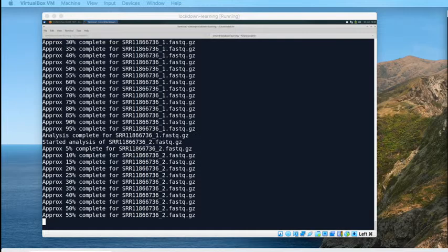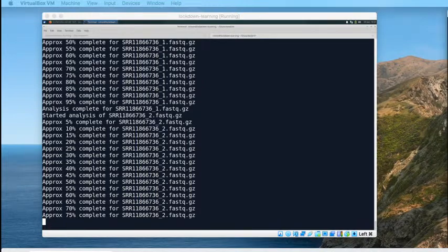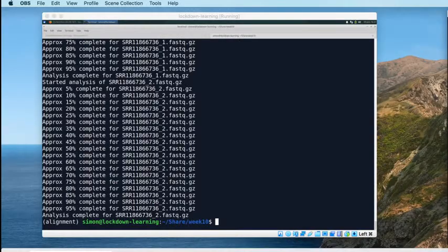So I'm not going to open the FastQC reports. I'm just going to run MultiQC, and we'll have a quick look at the MultiQC report. While this is just finishing, I'm just going to find the appropriate place in Finder. Okay, FastQC is very nearly done. One second, bear with me. There we go, so let's bring that back up. FastQC is finished.